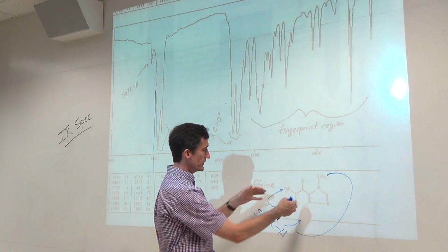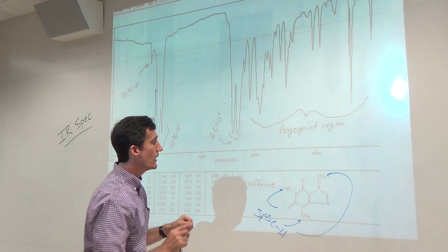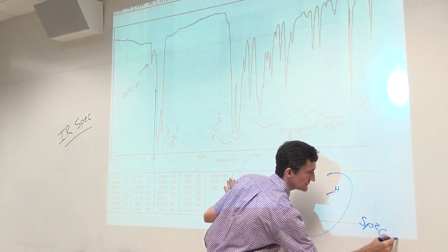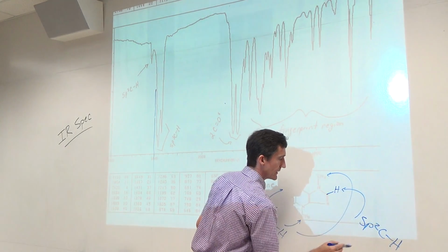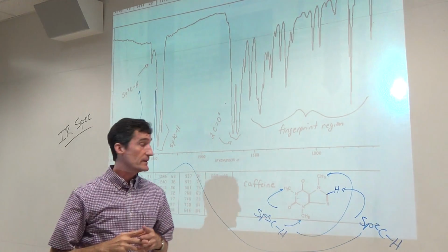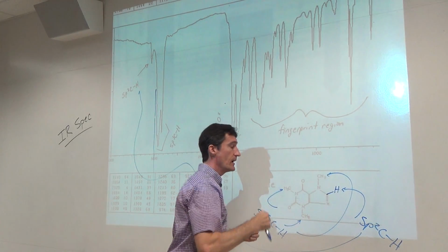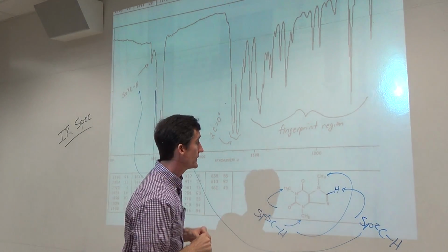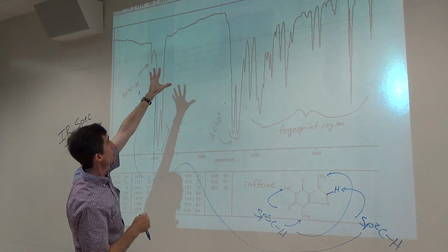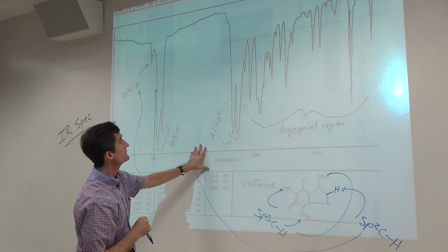Now we also have the structure here of caffeine. Okay? There's obviously no OH or NH in the structure. What do we have here? There's one H right here that is sp2 CH, and that is that peak right there. It's coming from that bond, doing some stretching, and then absorbing the IR, going to a higher vibrational level, and absorbing the light, and we can plot that absorbance. Okay, not much other absorbance. There's no absorbance in the triple bond region because there's no triple bonds here.